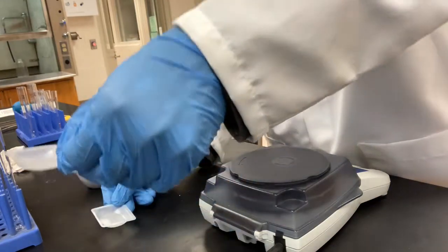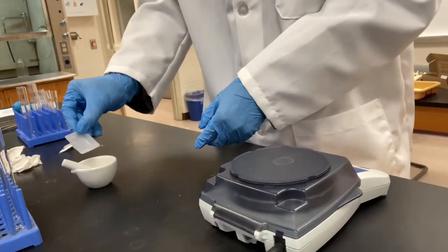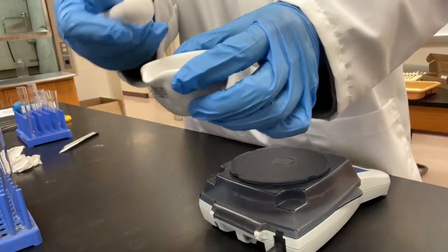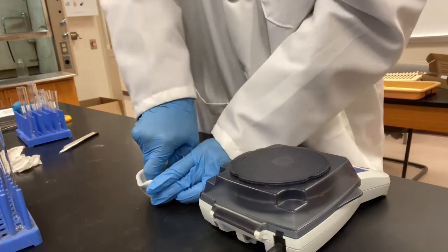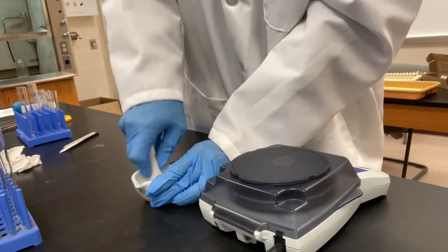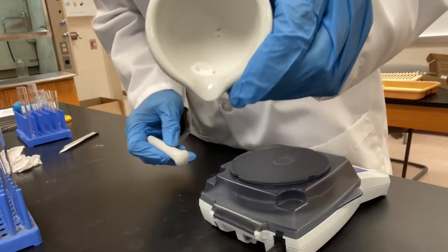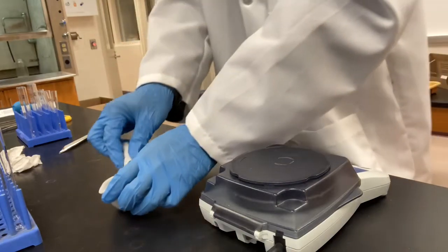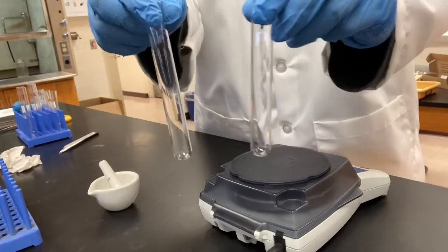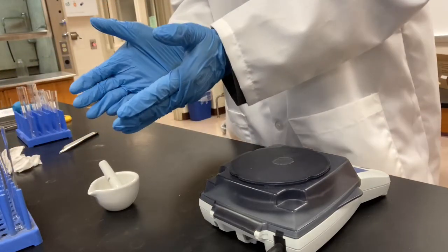So one of them, I'm gonna let it react with acid as it is. The other one, I'm gonna put into the mortar and pestle. I'm gonna grind it down to powder. Okay, now I'm gonna put these into the test tubes and add acid, and we'll just eyeball which one reacts faster.